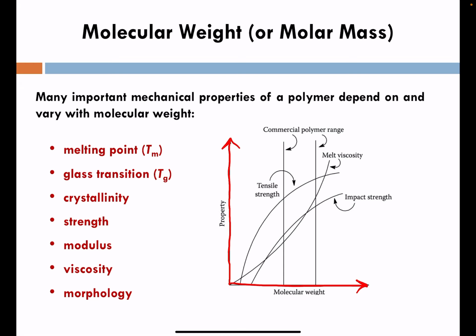We'll start here by knowing that commercial polymers typically are bound by these arbitrary limits, and so in a sense, commercial materials have more limited range in these properties, given that they have a lower and upper molecular weight limit to their profile.